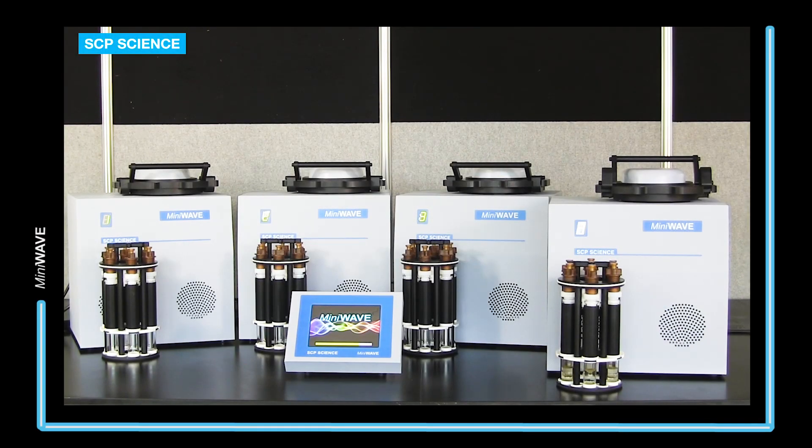The MiniWave by SCP Science is a top-loading, compact, axisymmetric microwave digestion system.